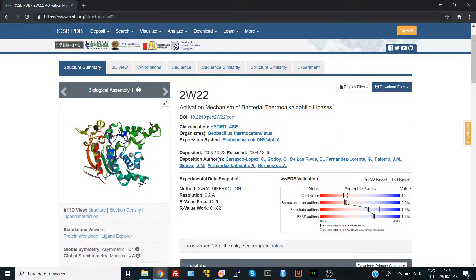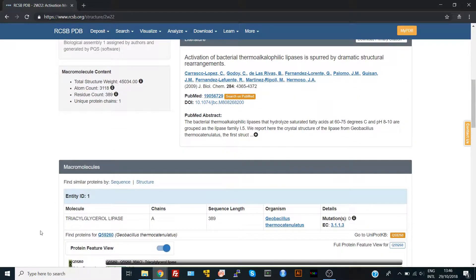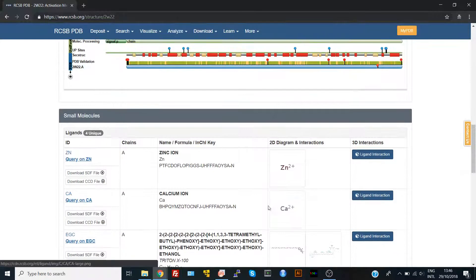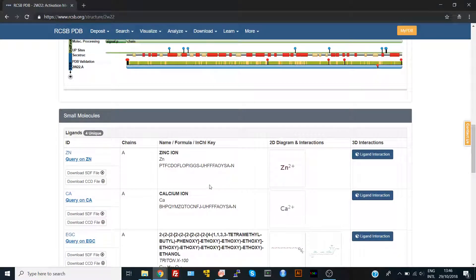You can also find other information like number of chains, sequence length — here we have 389 amino acids — the organism, and whether there are mutations in the structure or not. You can also find the small molecules that are in the structure.